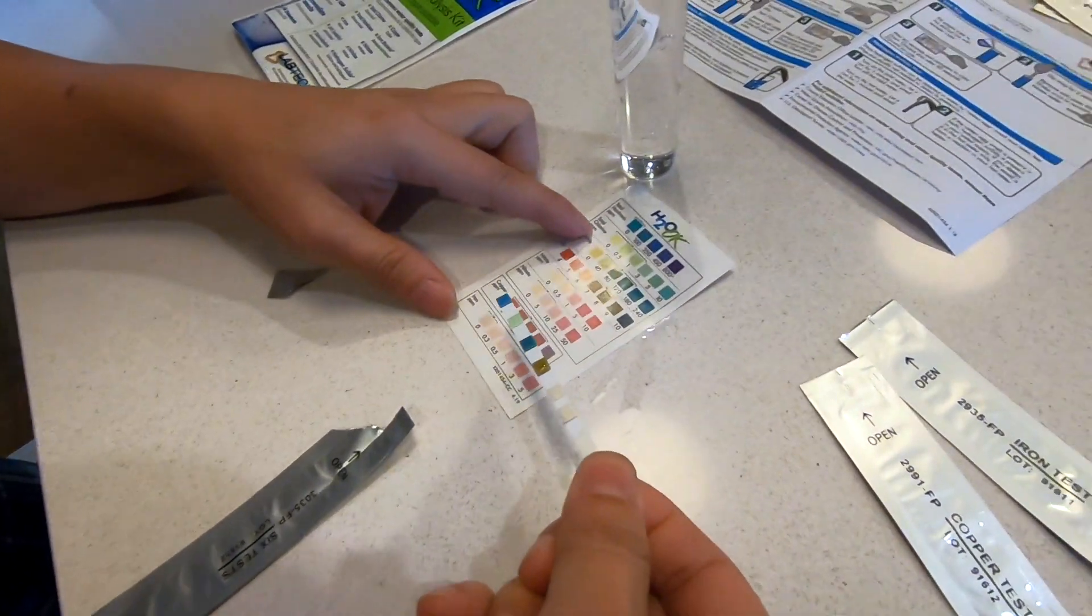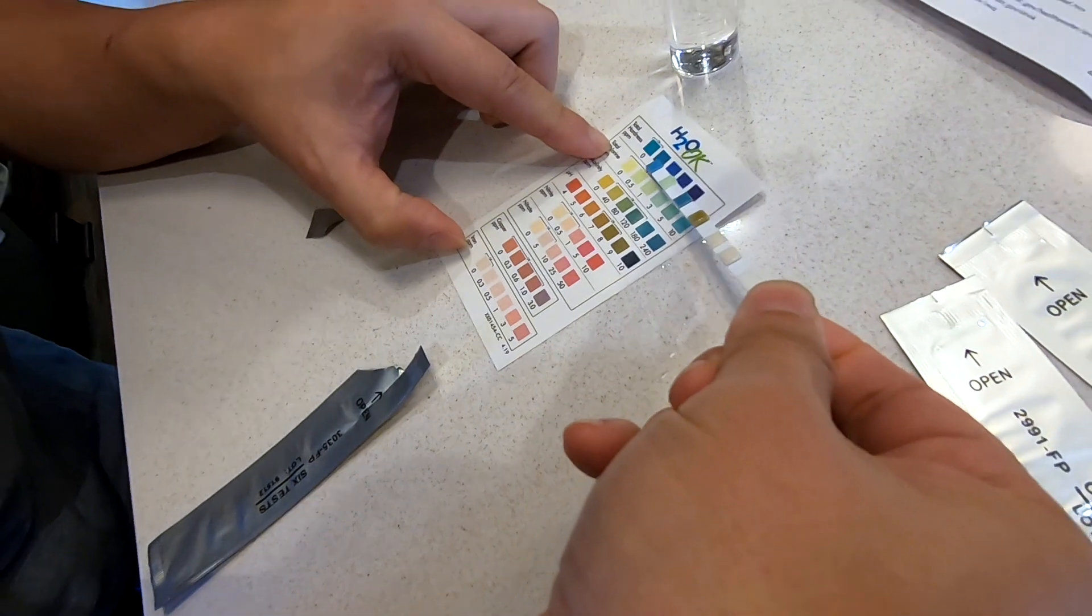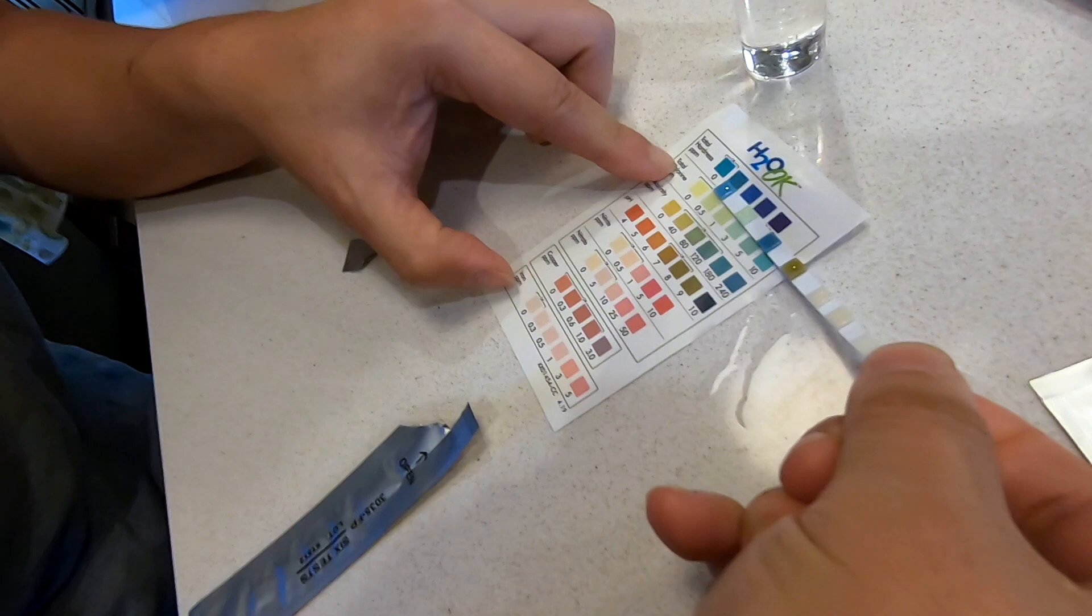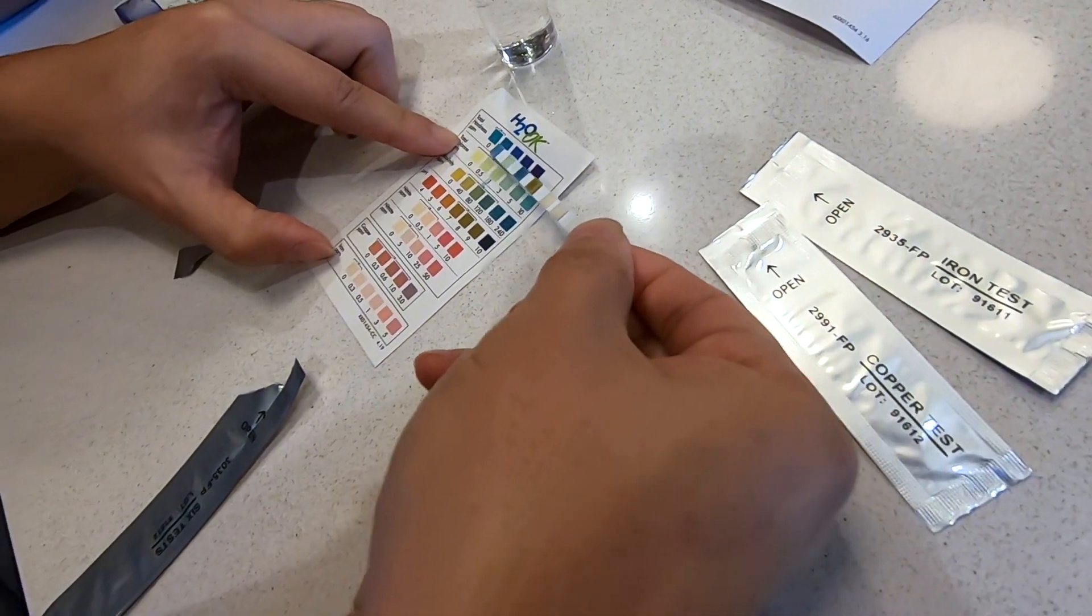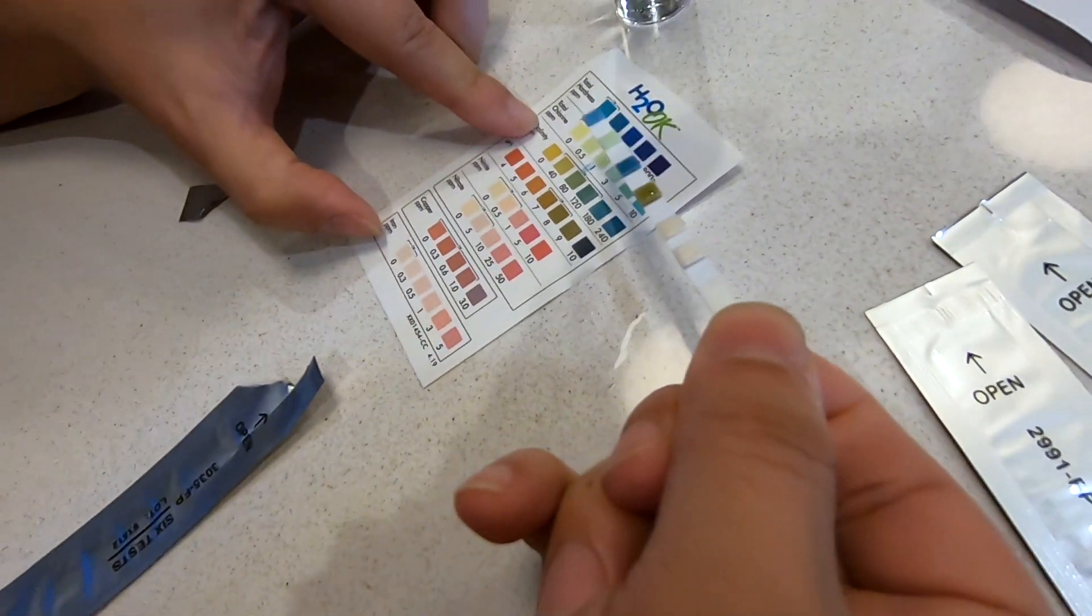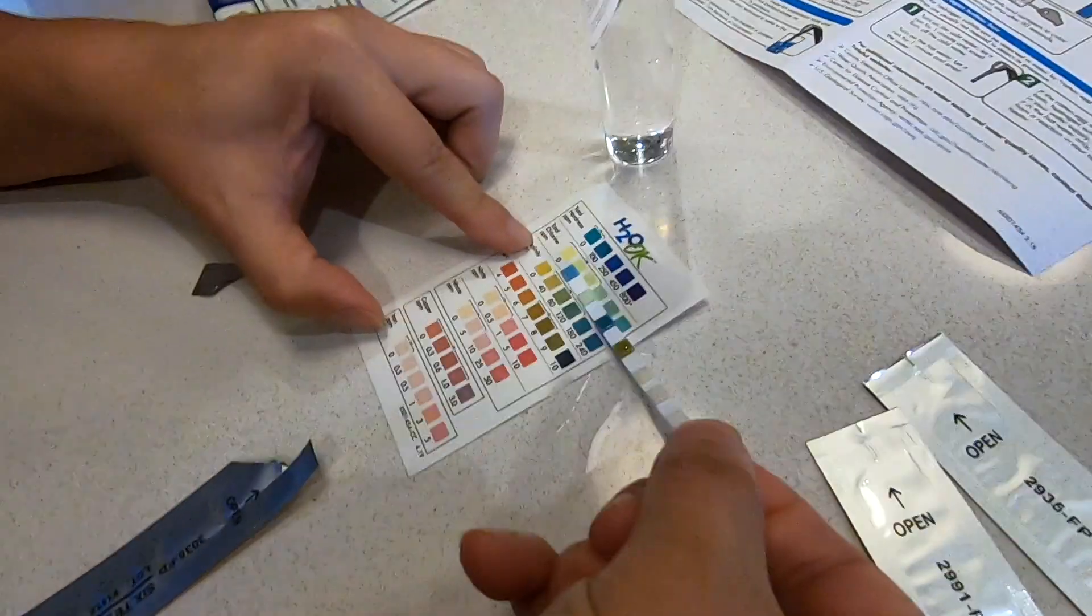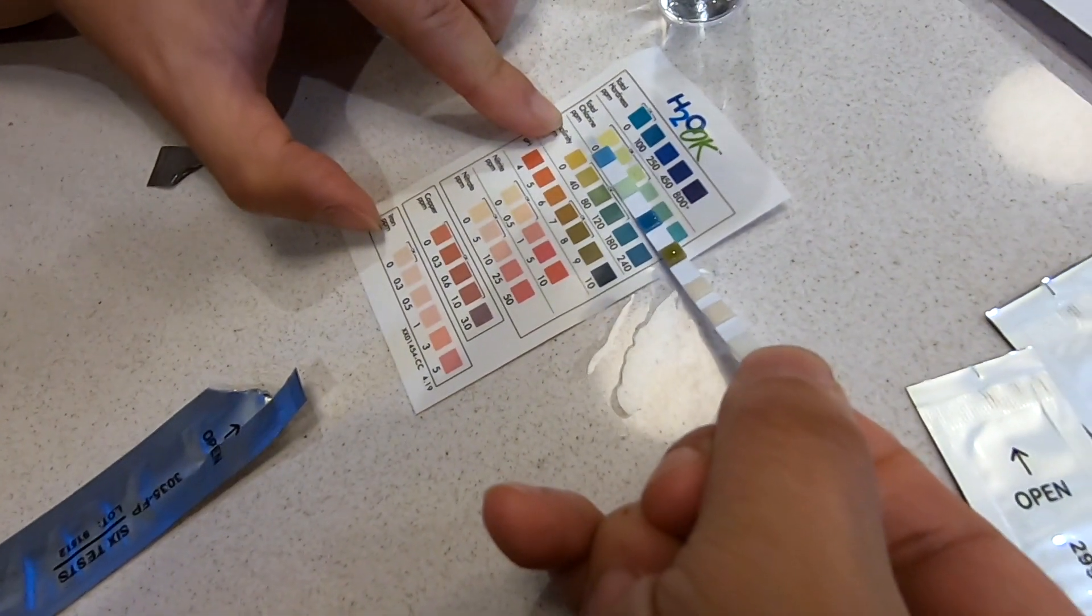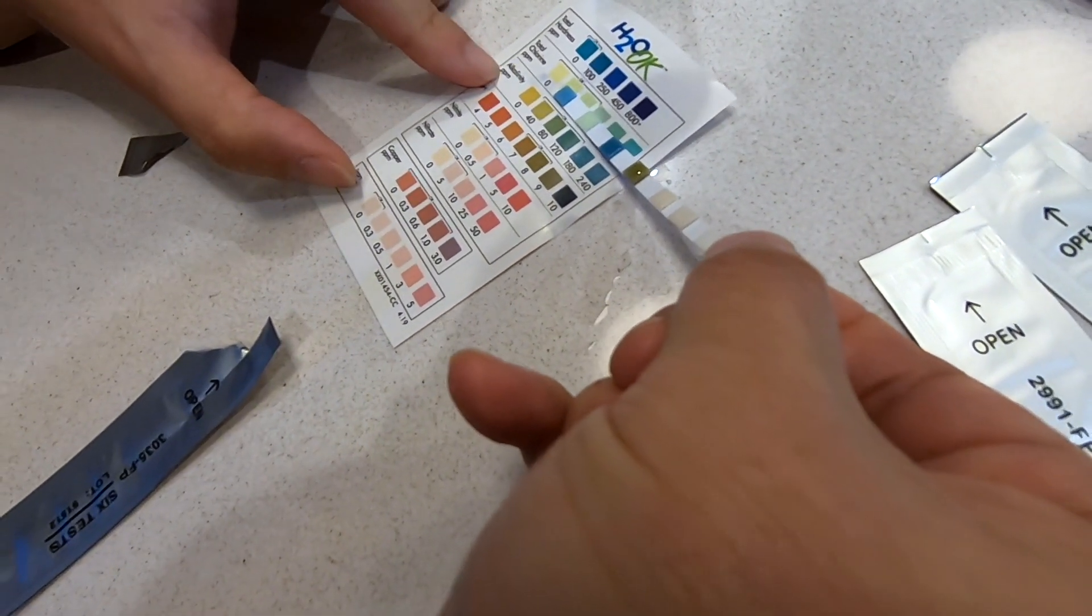For total hardness which is the first one, we are at about 100, slightly above. And for total chlorine, which is this one right here, we are slightly elevated also, somewhere around between this and this. We're slightly high too.